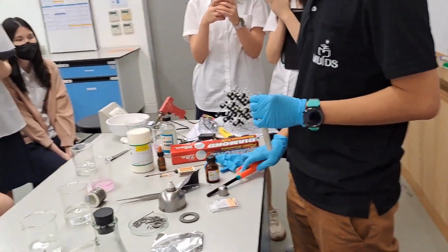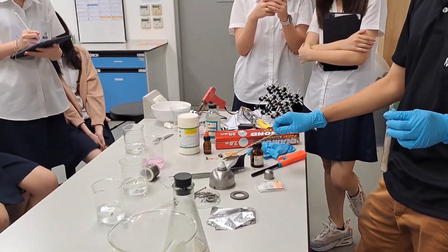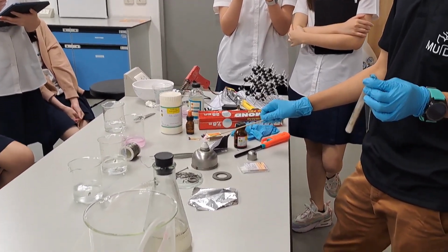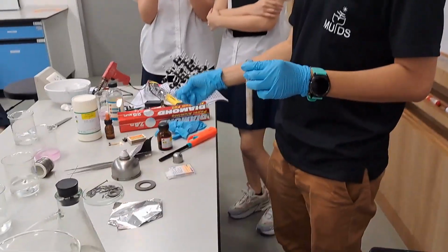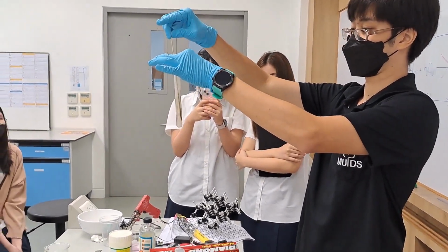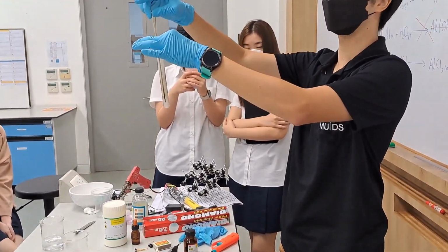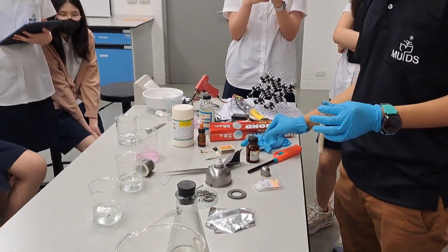Alright, let's see that. This is actually carbon dioxide, so let's put it back in again. Let's make it burning. Alright. So there's no more oxygen and only carbon dioxide, so the fire is put out.